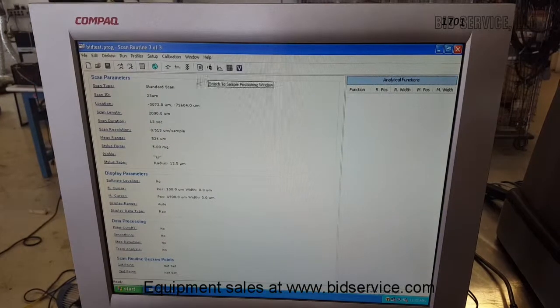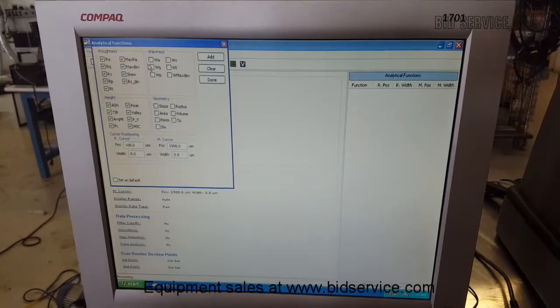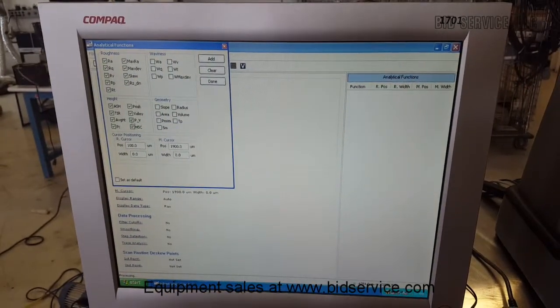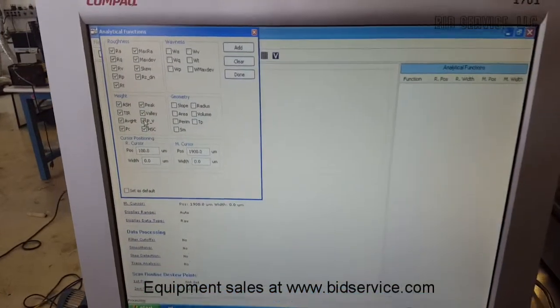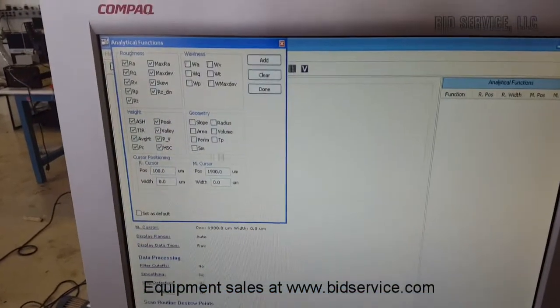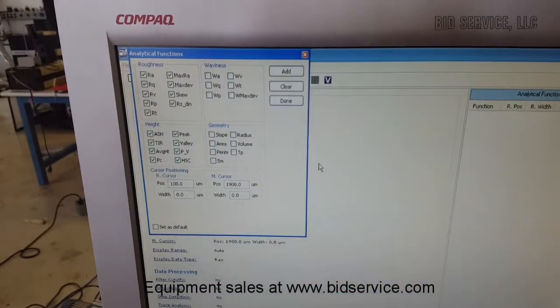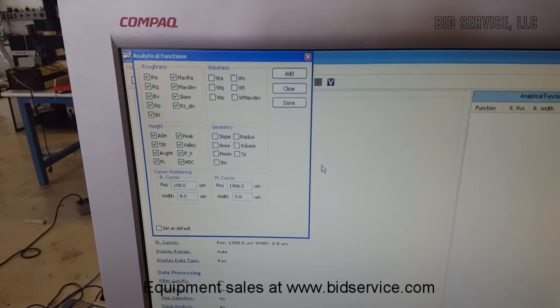This is where you set up the individual programs. If you go in here, you can choose any of these tests, and it will automatically calculate that when the scan is completed.